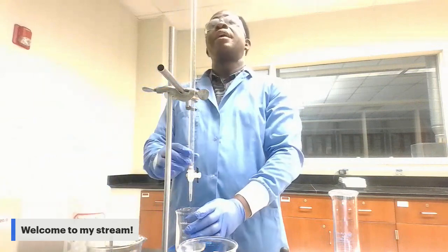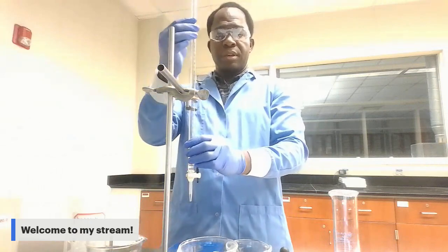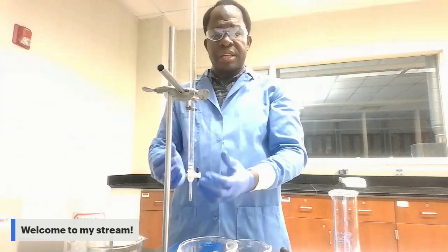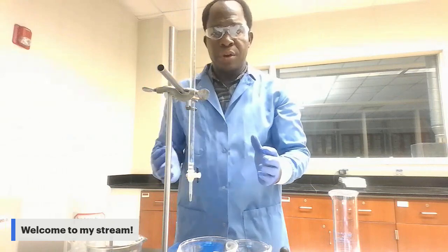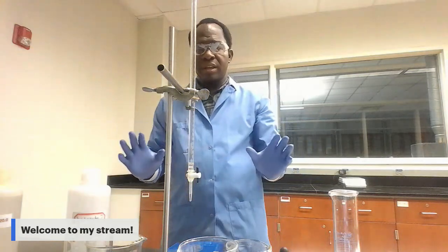So I just drained out my HCl. Next thing to do is to get the burette, fill it up with water, and drain the water out. That's the easiest way to clean your burette. So when you're done cleaning up, you're then done with the lab.